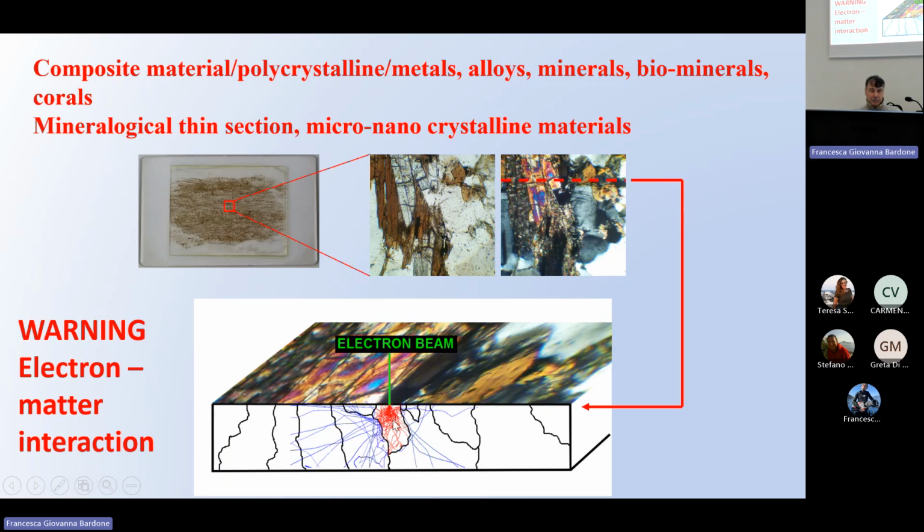Always keep in mind also that the X-rays which come from 5 microns on average can interact with other crystals aside, and the final information could be affected also by the side crystals of your object.